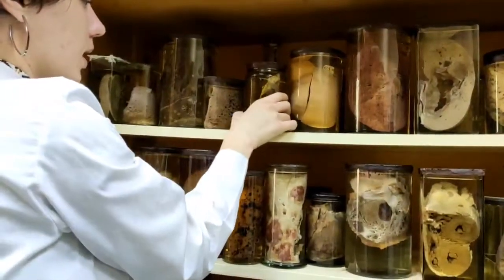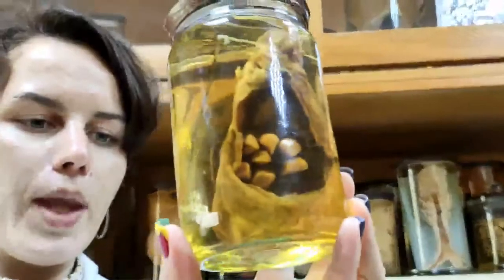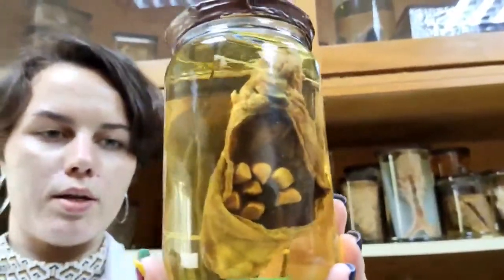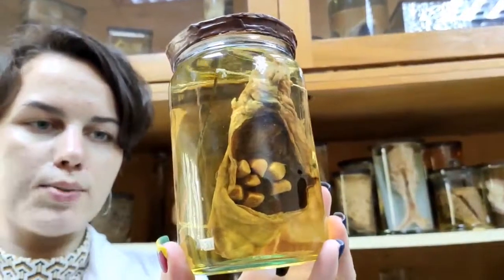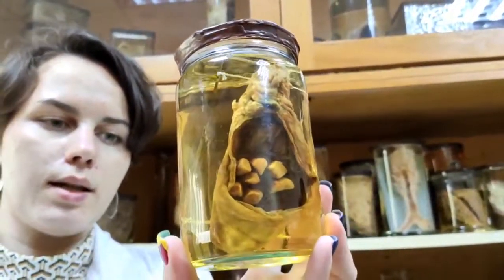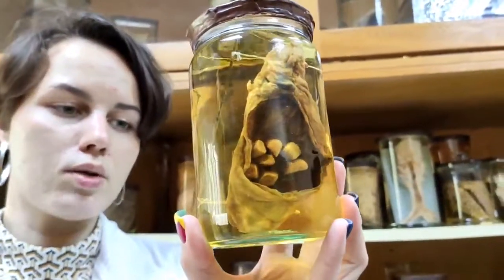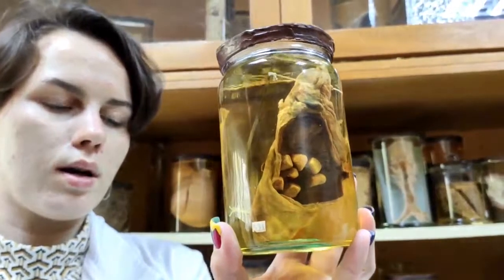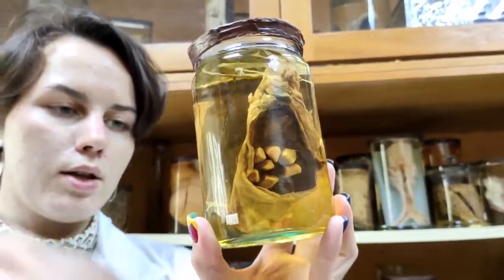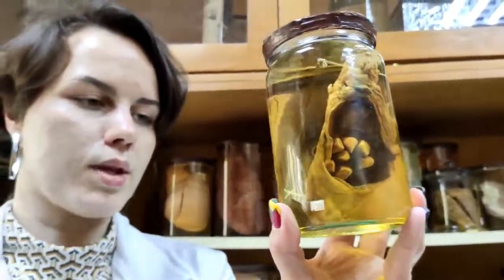The next specimen is chronic cholecystitis, and you can see the gallbladder, and the wall of the gallbladder is thickened because there is chronic inflammation in this patient. Besides, you can see in the hollow of the organ a lot of stones. Stones are concrements which are situated in the lumen of the organ and which can be freely removed from this lumen.